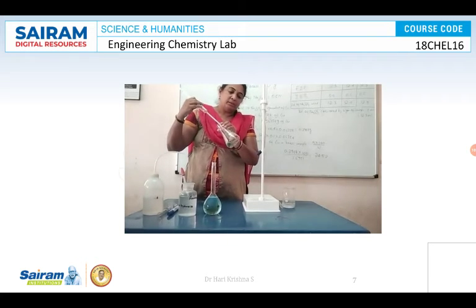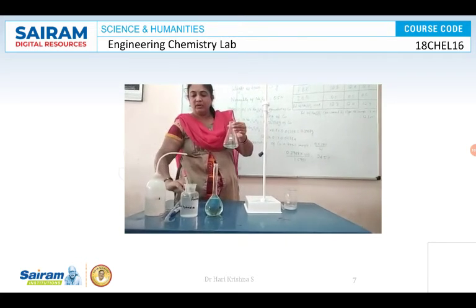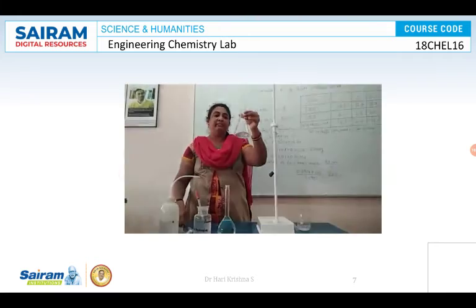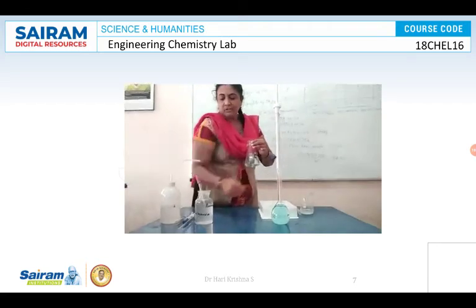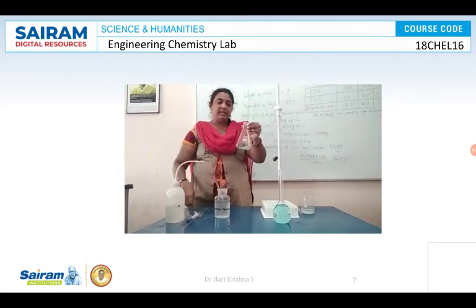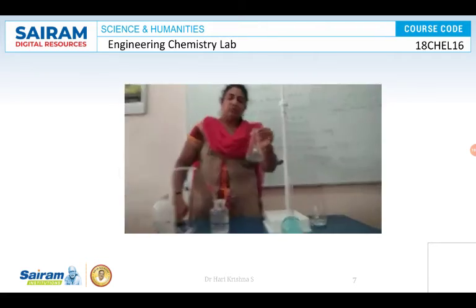Now next step is, see, we have taken 25 ml of the prepared copper sulfate solution. Now we should add dropwise ammonium hydroxide until you get a dark blue coloration.